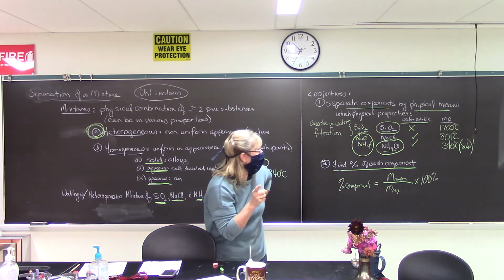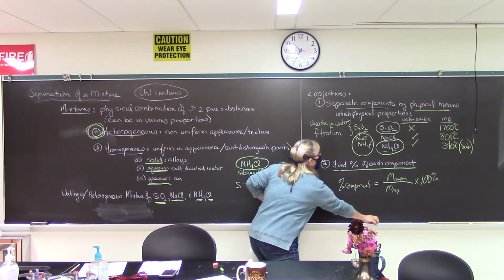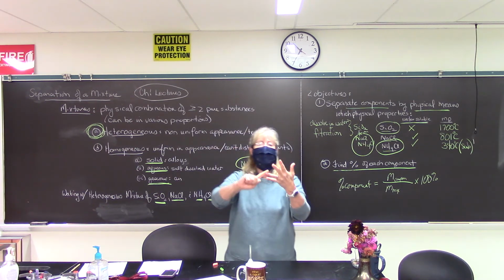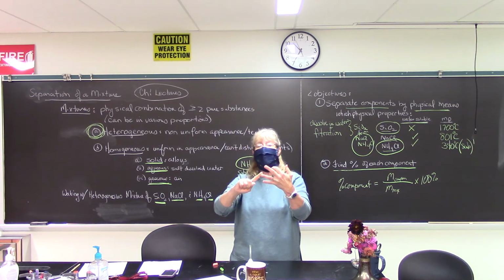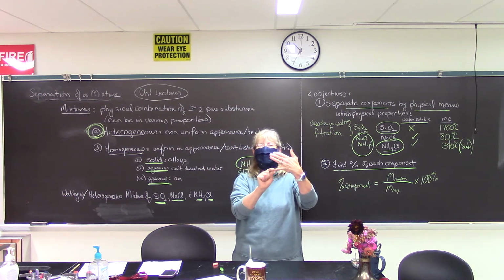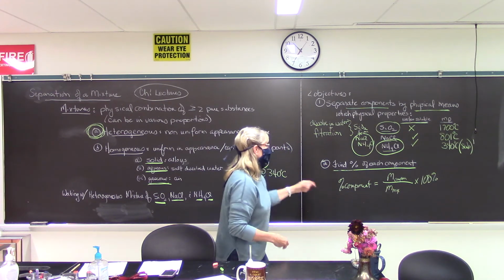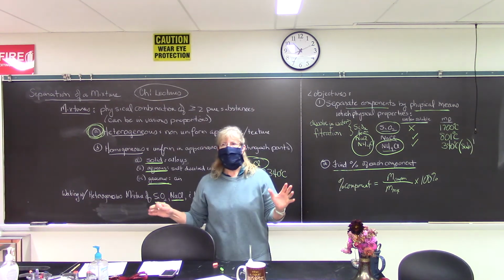So how would I find the mass of the ammonium chloride? Well, remember, the mass of your mixture contains sand and salt and ammonium chloride. If you know the mass of the sand and salt, that leaves the ammonium chloride. Then you can figure out, by subtraction, the mass of the ammonium chloride. Okay? Once you do that, you find your 3 components, and you're golden.